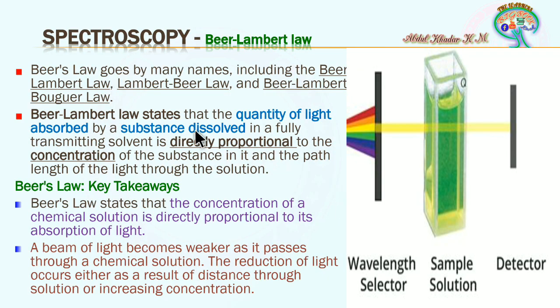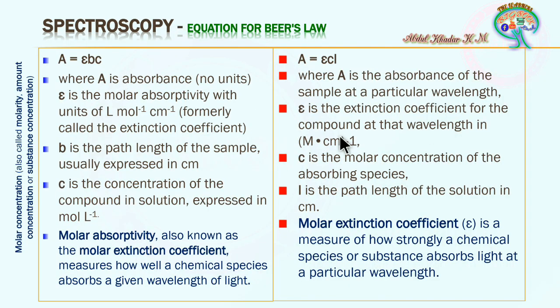Now when a particular wavelength is passed through the sample, the wavelength is going to differ further after absorption. So whatever compound is present will have a particular molarity, and this molarity is considered per centimeter. So that is the meaning of per molar and per centimeter.